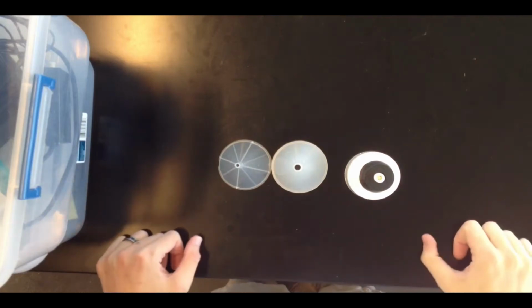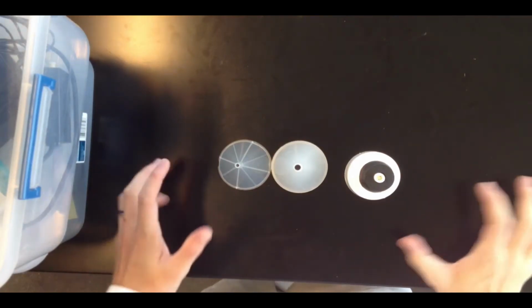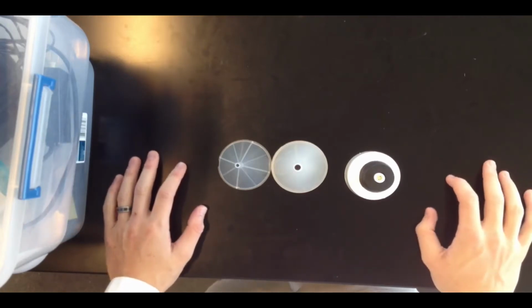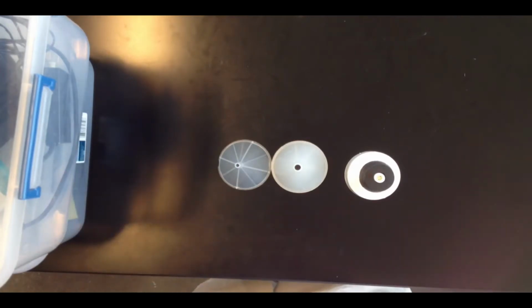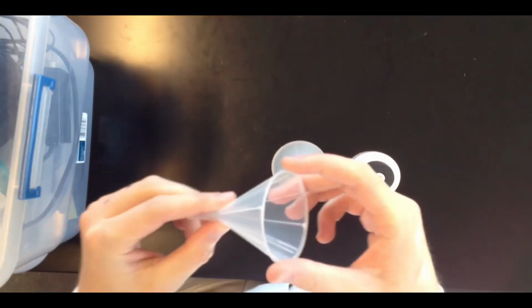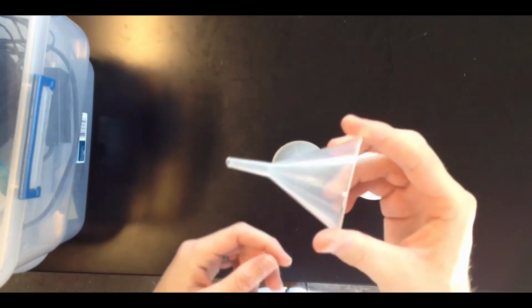Let's talk about funnels. You're going to notice some very different types of funnels in your laboratory, and each of these has a very specific function. There are three big classes of funnels that we'll use throughout the semester, and I want to show them to you now.